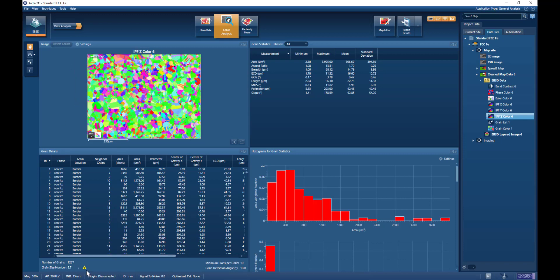More than 100 is a very high setting, and to get an accurate grain size measurement with that, we would need to have a very small step size. So in general, we will set it to a minimum of 10 pixels per grain, and we will have this warning signal.